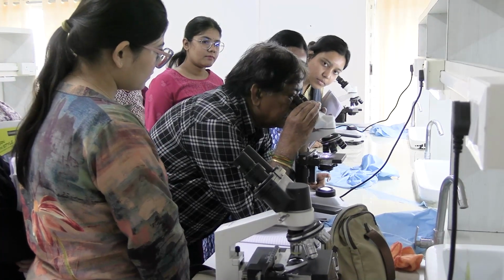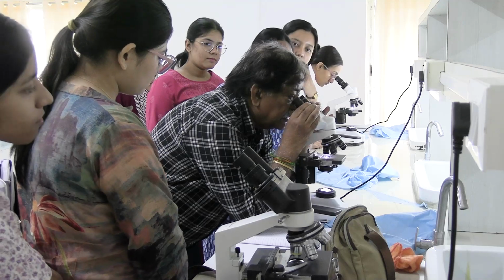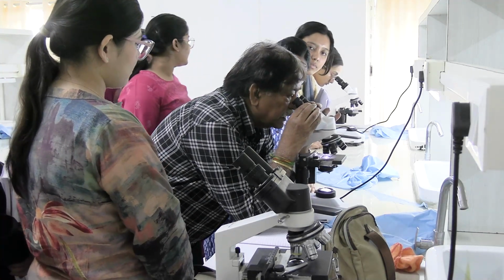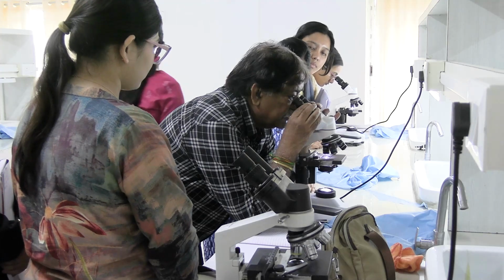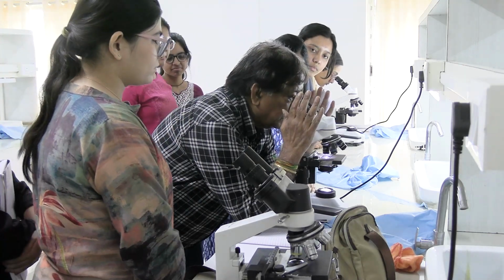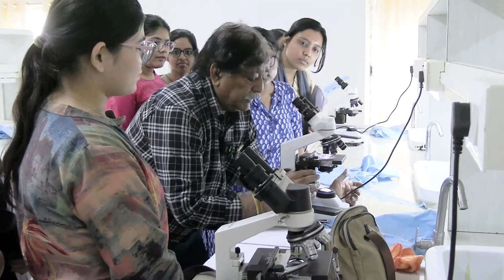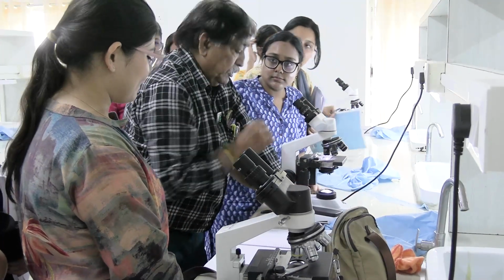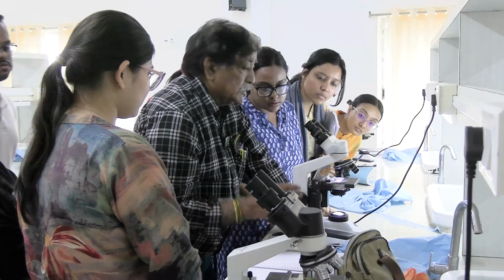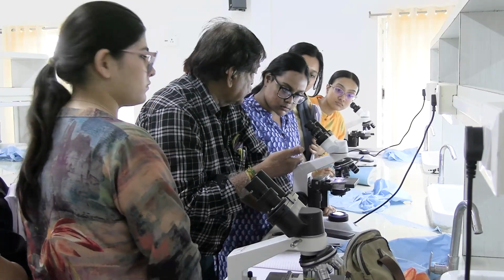You view with your two eyes, and it is adjustable according to your vision, you adjust. This adjustment to my vision is complete. Now in the examination hall, you just have to adjust the fine adjustment, because otherwise the microscope is set.